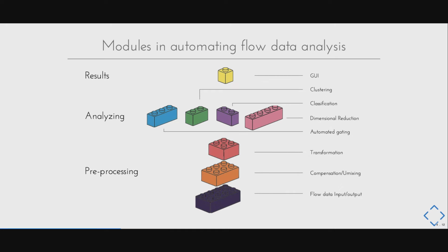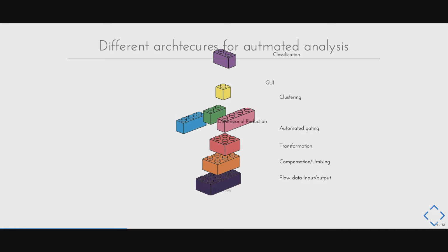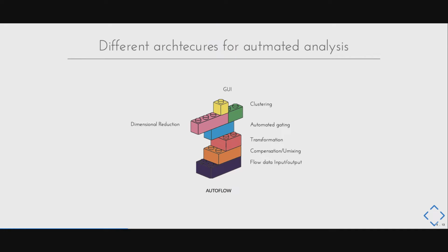So going back to the Lego analogy, building an automated analysis system is like assembling Lego bricks into various structures, architectures. So here are several architectures developed or used by our and other groups. First is AutoFlow, our LPD automated analysis system. It integrates the clustering and the dimension reduction following the automated gating steps.